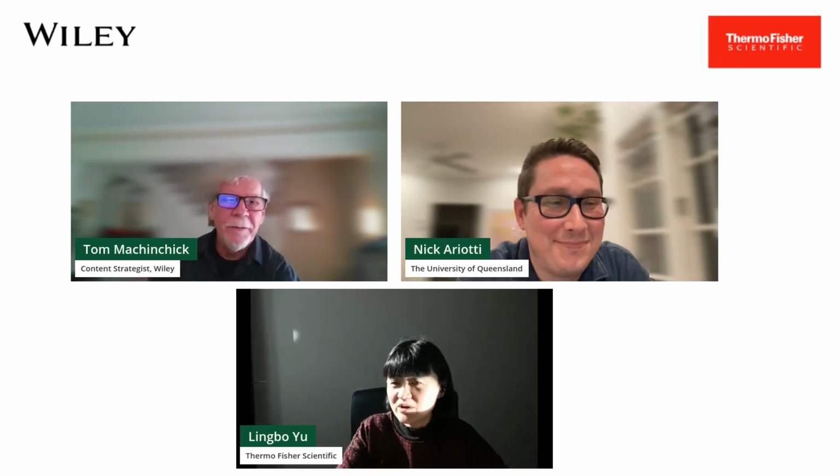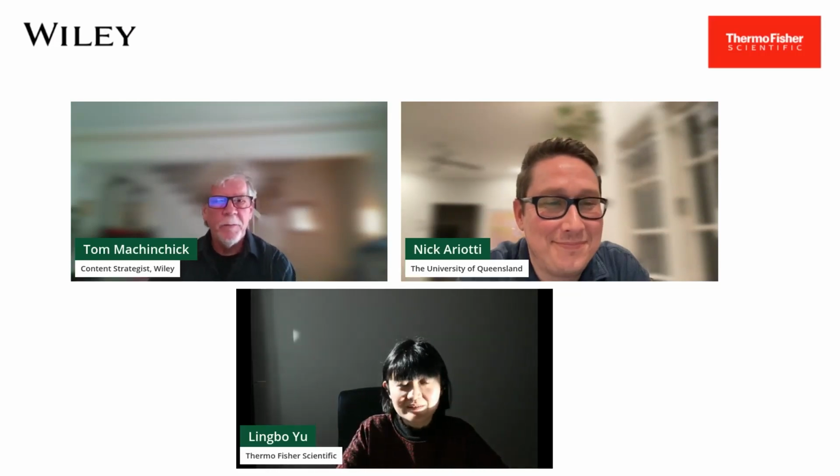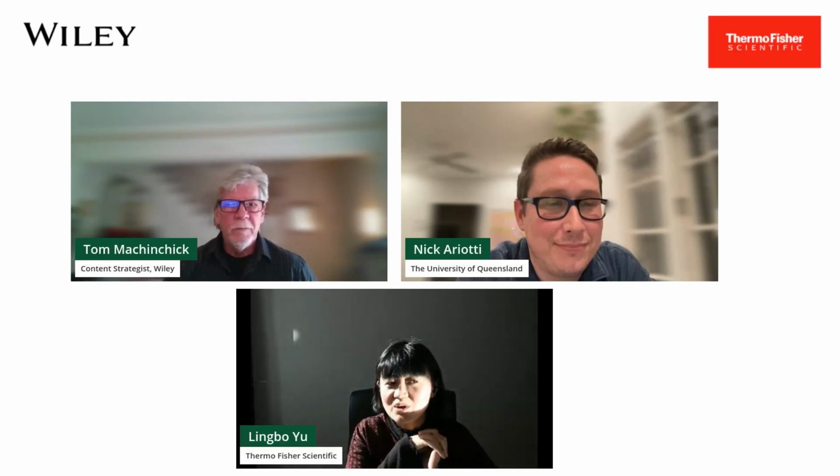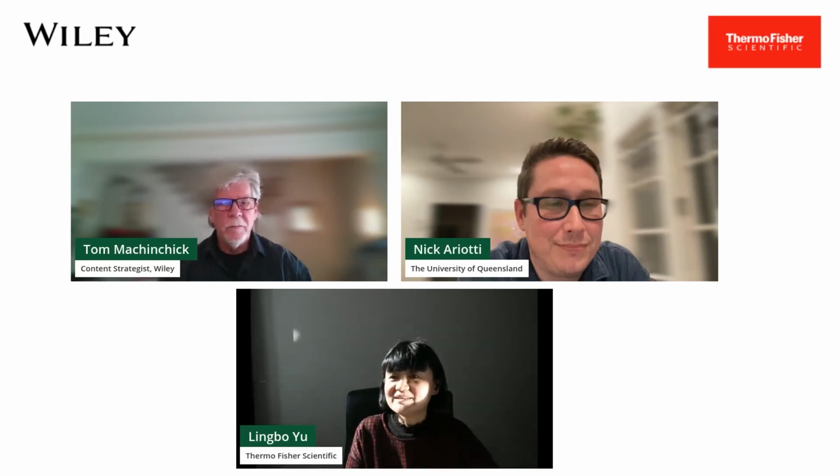And then one thing we also introduced is something called the discovery view. So I showed this pyramid view. Discovery view allows you to browse your data afterwards with this pyramid view.